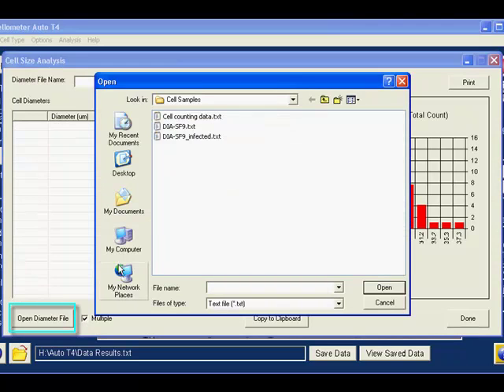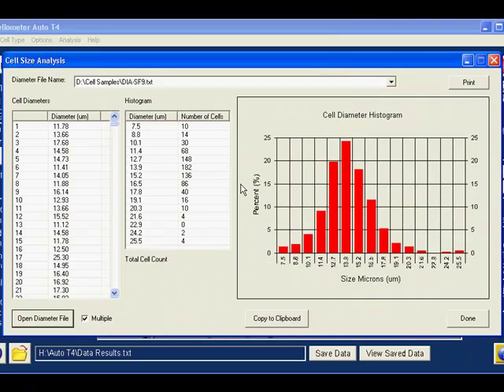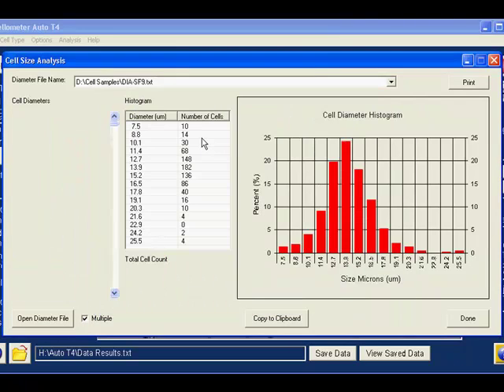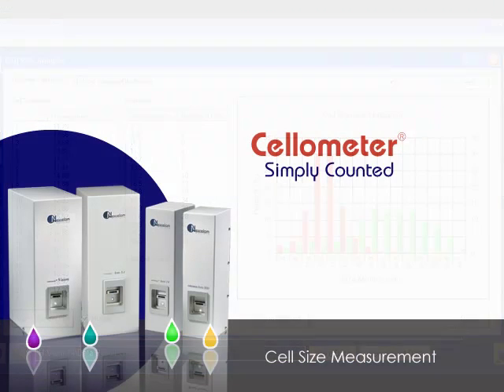To compare multiple histograms, simply check off the multiple option and select the files you wish to compare. Multiple histograms can be overlaid for determining changes in cell sizes over time. You can also select print to keep a hard copy of your data.